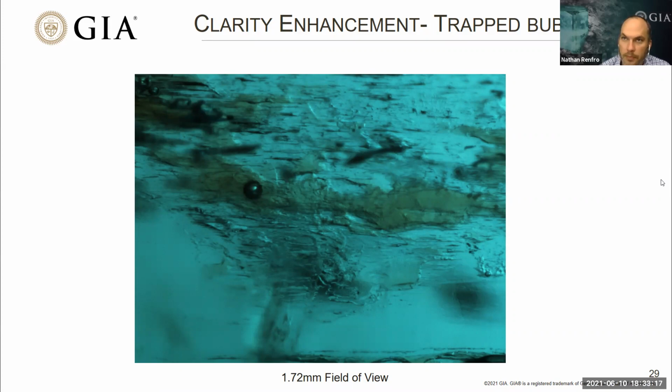Certainly the biggest overlap and probably the most confusing deposit is stones from Afghanistan. In the microscope, those can very much look like Colombian. And so that's where the trace element chemistry, which we'll talk about in a little bit, will come into play.